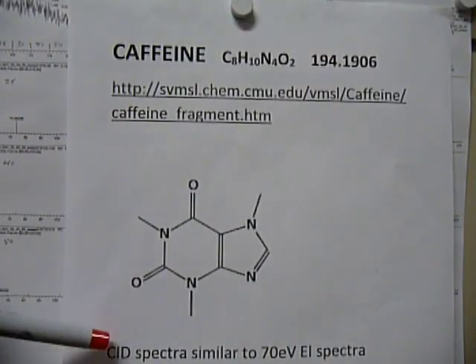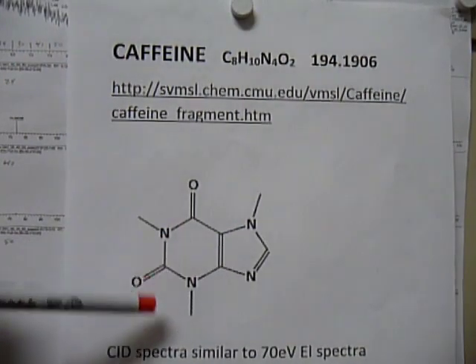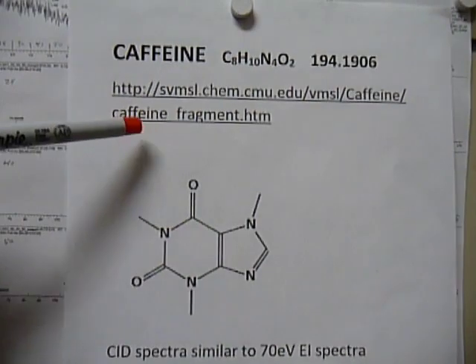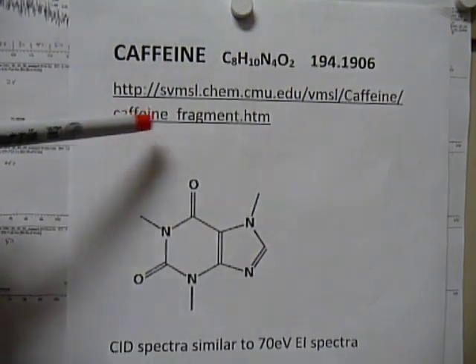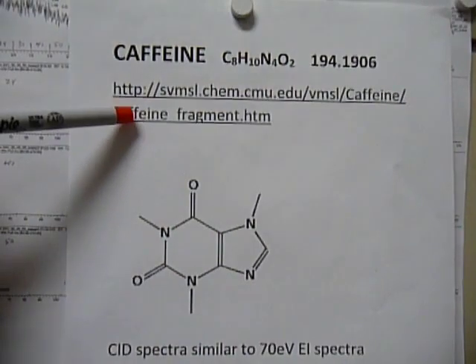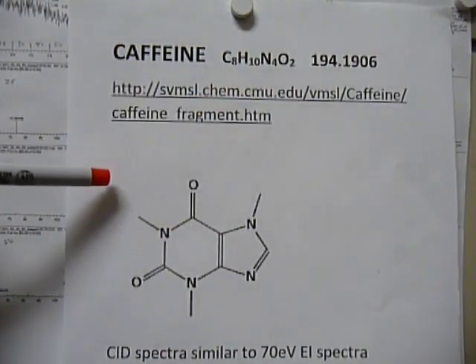These CID spectra for caffeine are pretty similar to the 70 EV EI spectra. There's a website that goes into the fragmentation of caffeine. The link is in the show more.